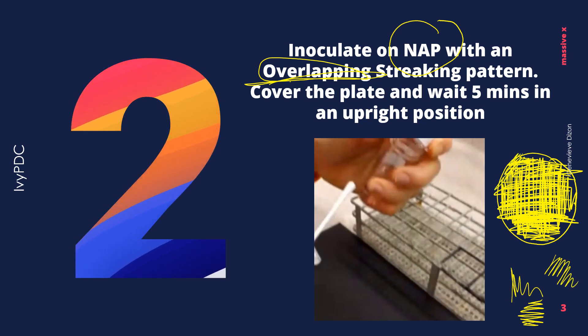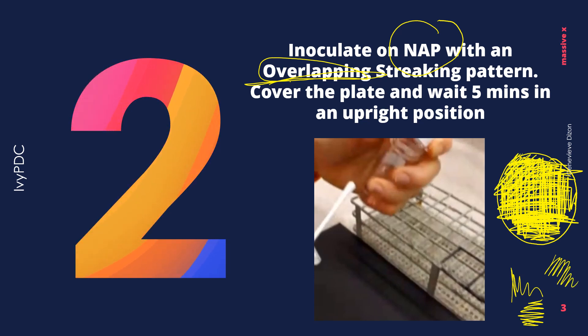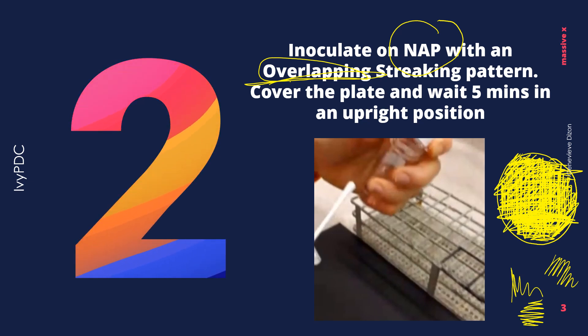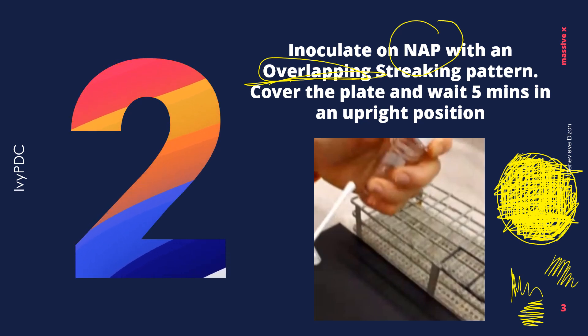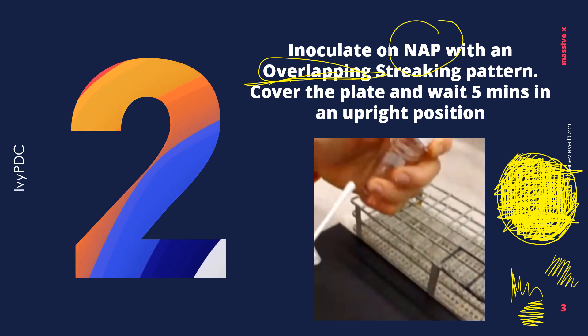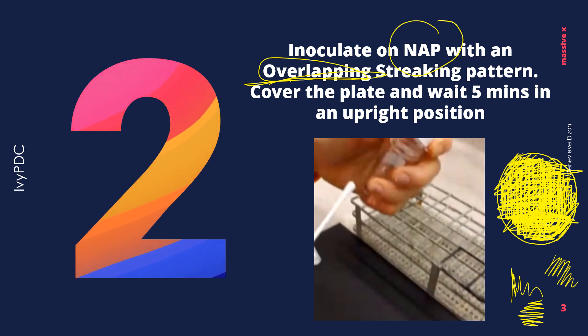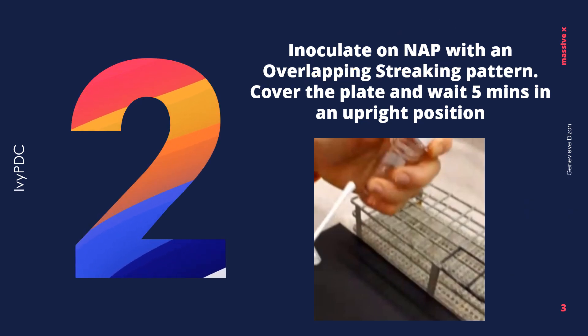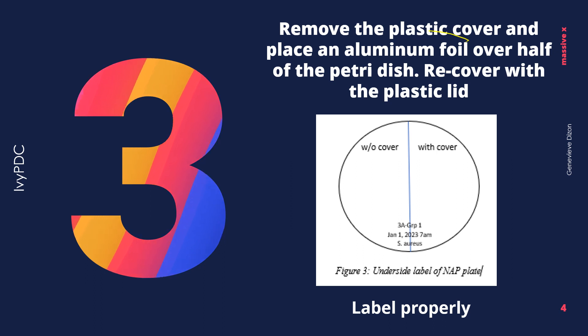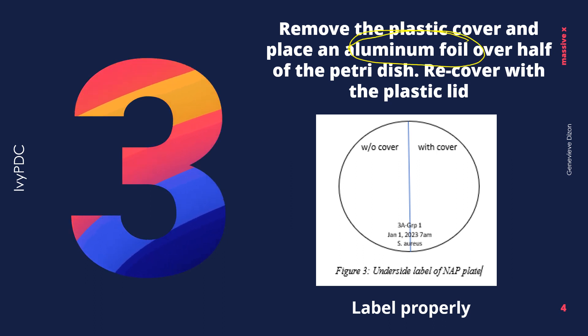From here, going all the way down, you can rotate your petri dish while you streak so that you can perform the pattern better. After the fourth streak, there should be no spaces in your petri dish and it should be completely covered with organism.